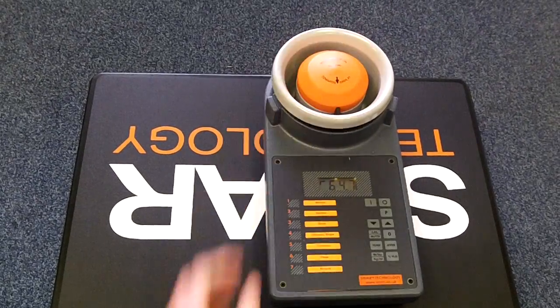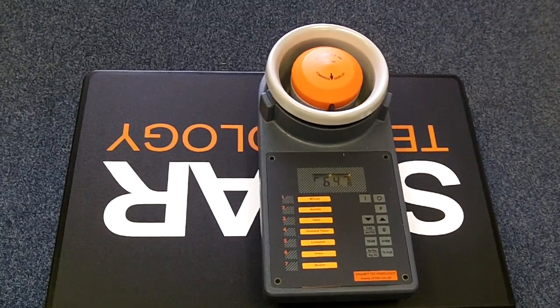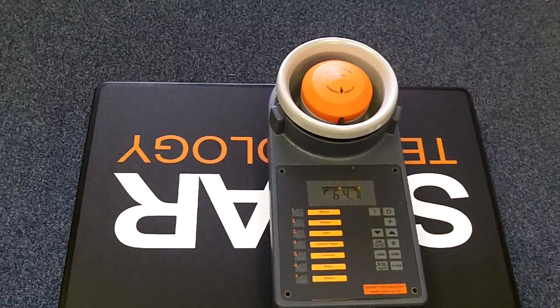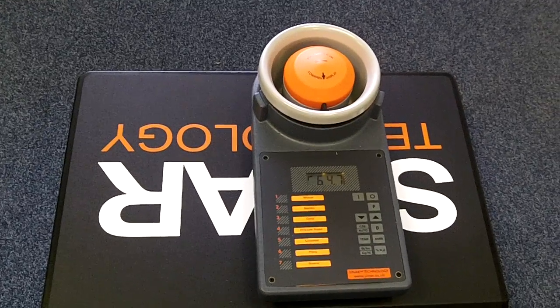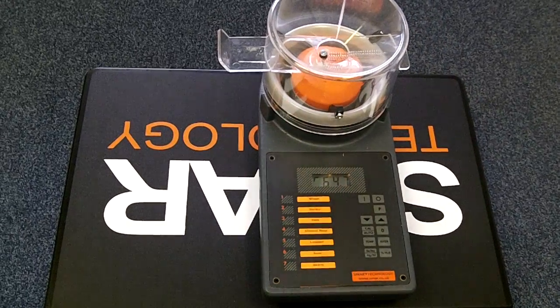You can then replace the cell as before. Now I'll show you how to take readings with the instrument. To load the instrument, close the slide on the hopper and place this on top of the instrument.